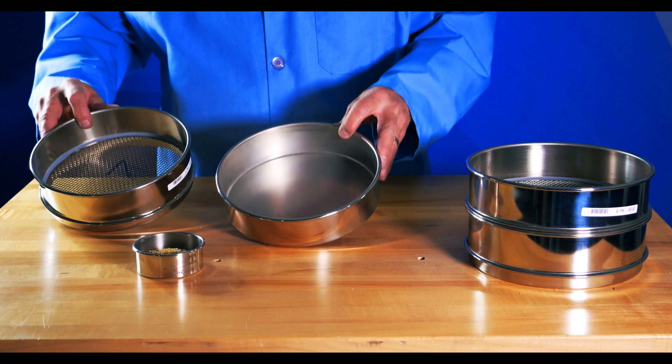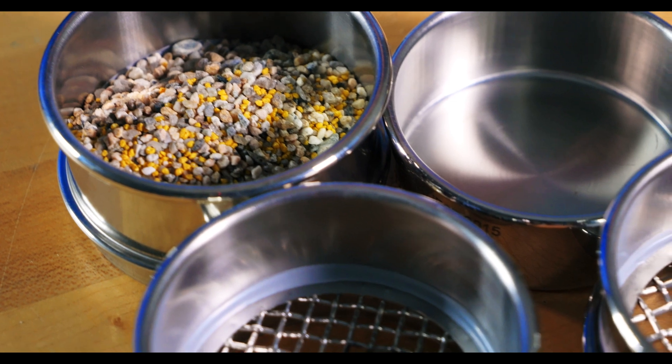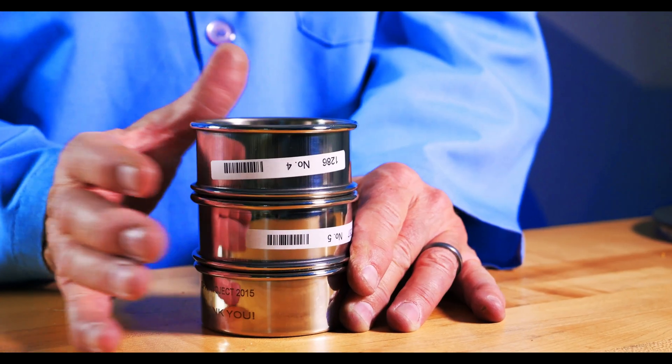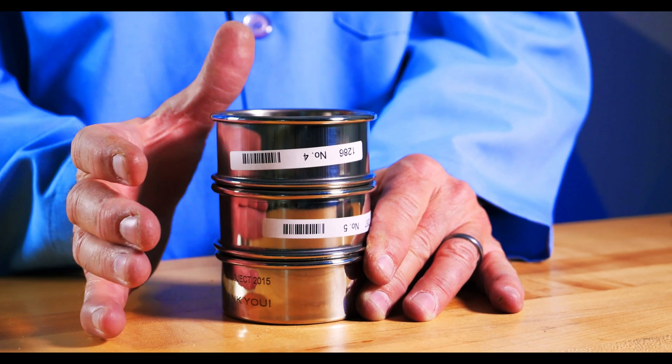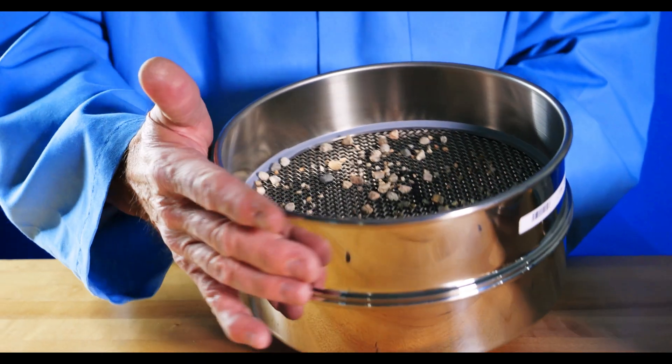Test sieves of any diameter and construction can be used to manually separate particles. As long as the user can easily handle the sieve and there's no tears in the mesh, a 3-inch sieve to an 18-inch diameter sieve could be used. You do want to ensure that the height of the sieve allows room for your material and for the tapping. You should also ensure best practices are employed to best maintain your sieves in between testing.